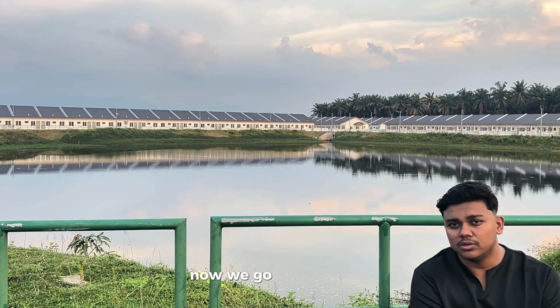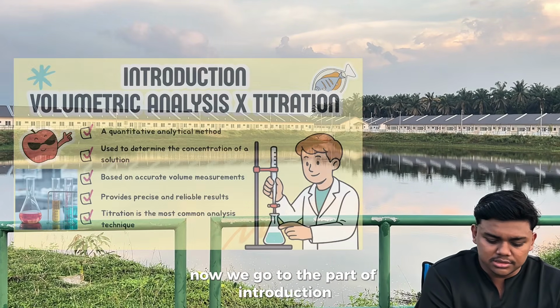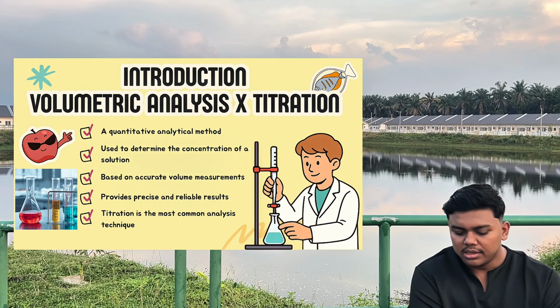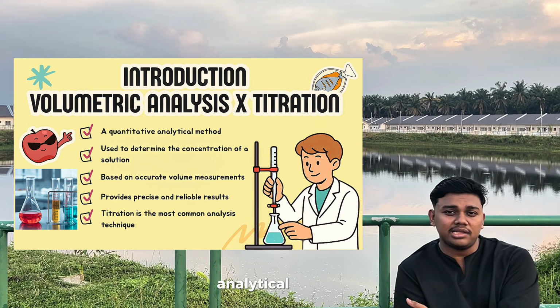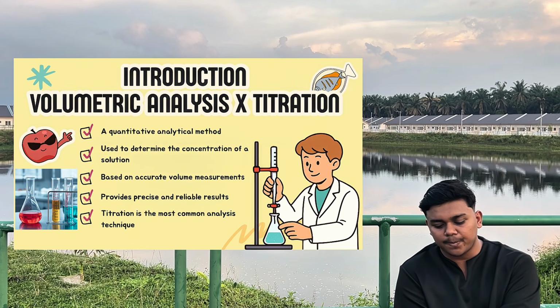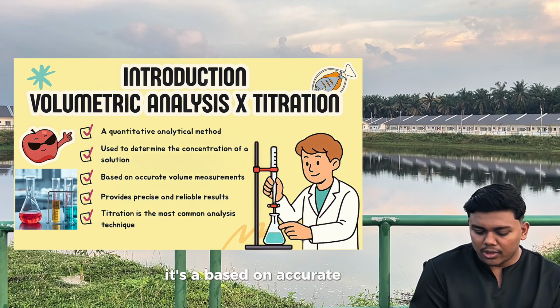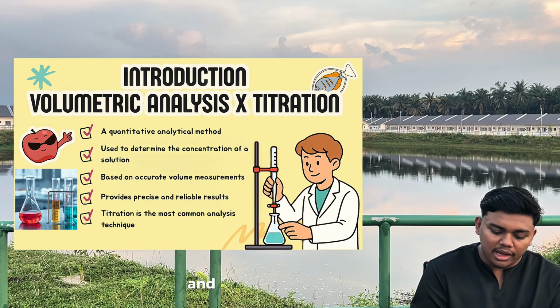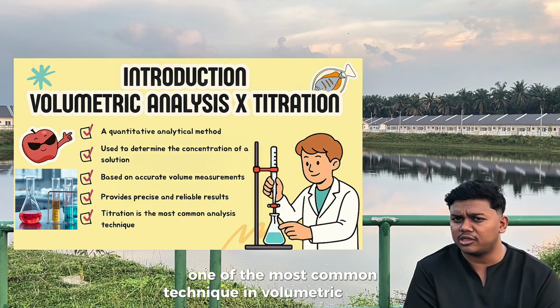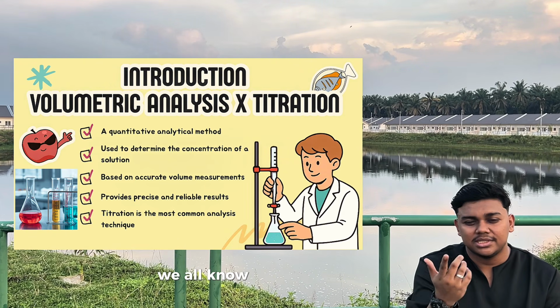Now we go to the part of introduction of volumetric analysis. So what is volumetric analysis? Volumetric analysis is a quantitative analytical method used to determine the concentration of solution. It's based on accurate volume measurement and provides precise result. One of the most common techniques in volumetric analysis, we all know, is titration.